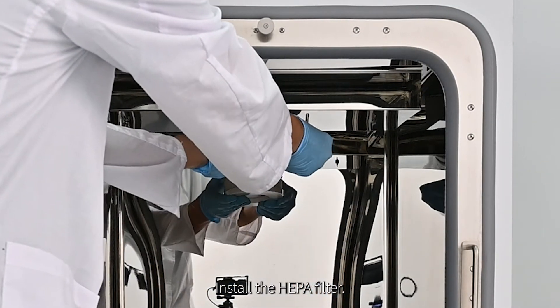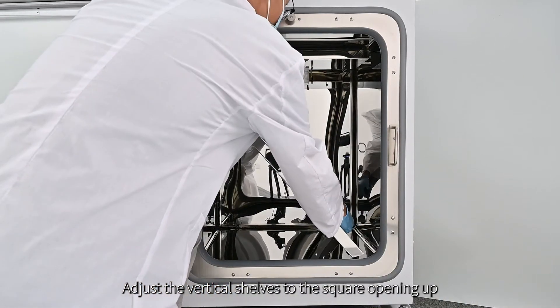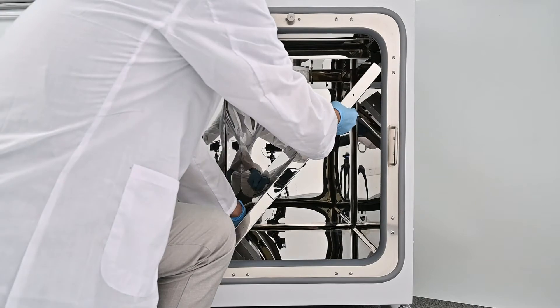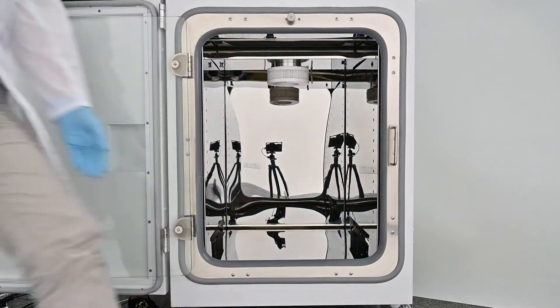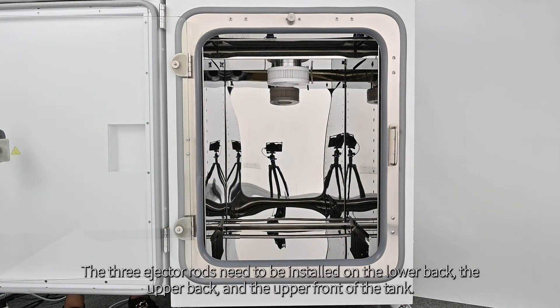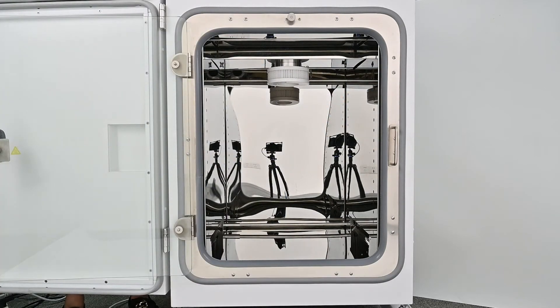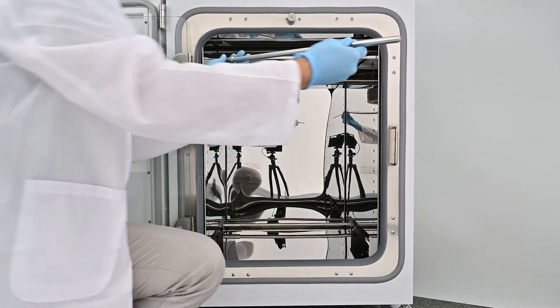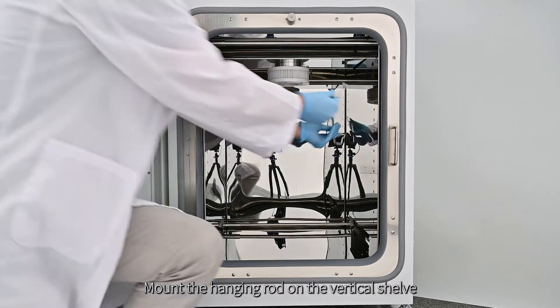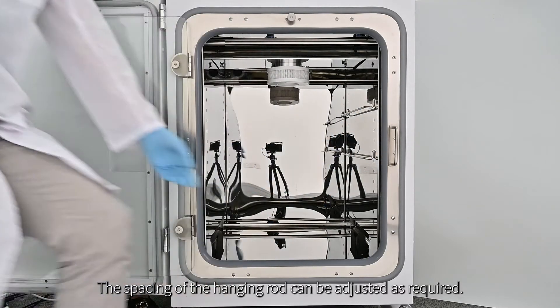Install the HEPA filter. Adjust the vertical shelves to the square opening up, tilt them to fit into the incubator, and then adjust them to a vertical position. Install the ejector rods between the two vertical shelves. The three ejector rods need to be installed on the lower back, the upper back, and the upper front of the tank. Mount the hanging rod on the vertical shelf to support the horizontal shelf. The spacing of the hanging rod can be adjusted as required.